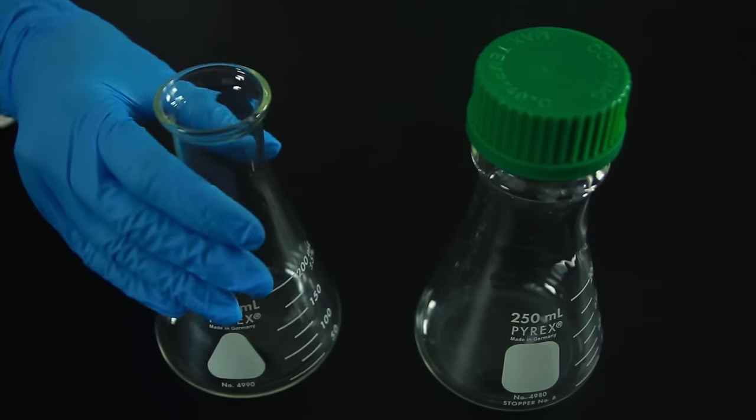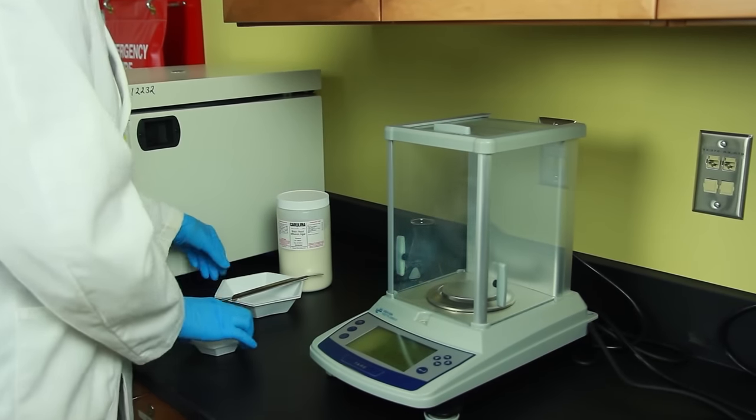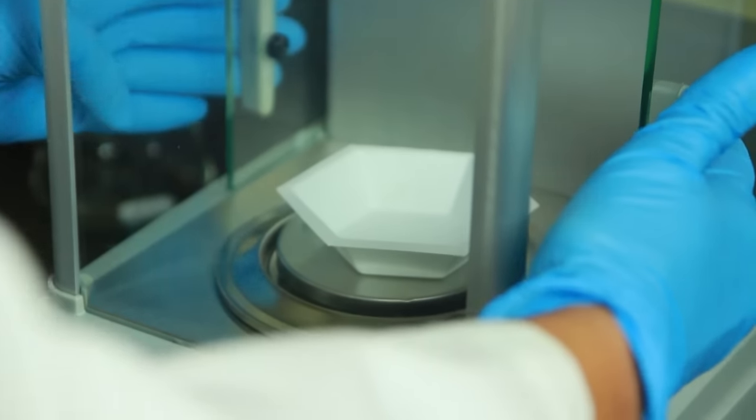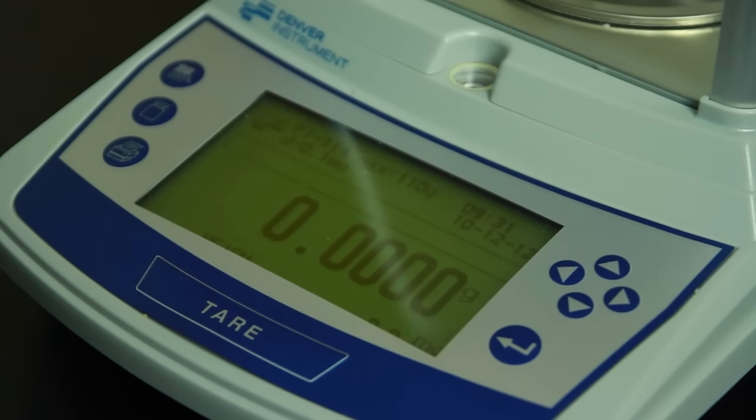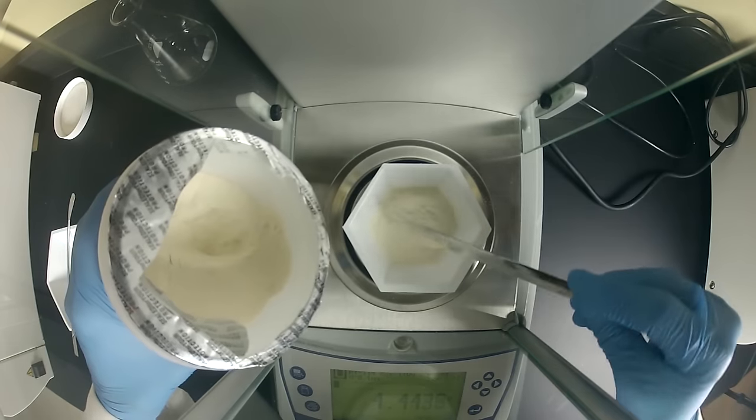Place a stir bar in a 250 milliliter flask. For the next step, we need an analytical balance. Place a weigh boat onto the balance pan. Press the tare key to zero out the weigh boat. Use a lab scoop to add 5.2 grams of brain-heart infusion agar to the weigh boat.